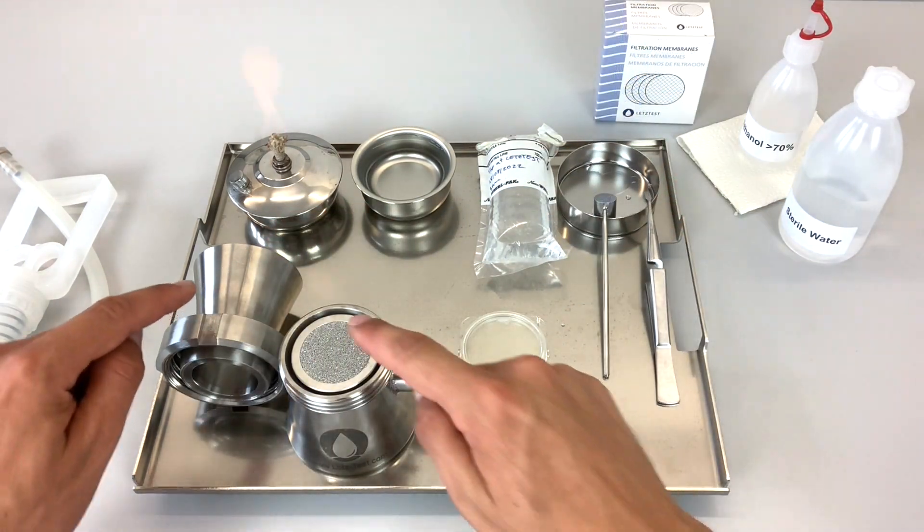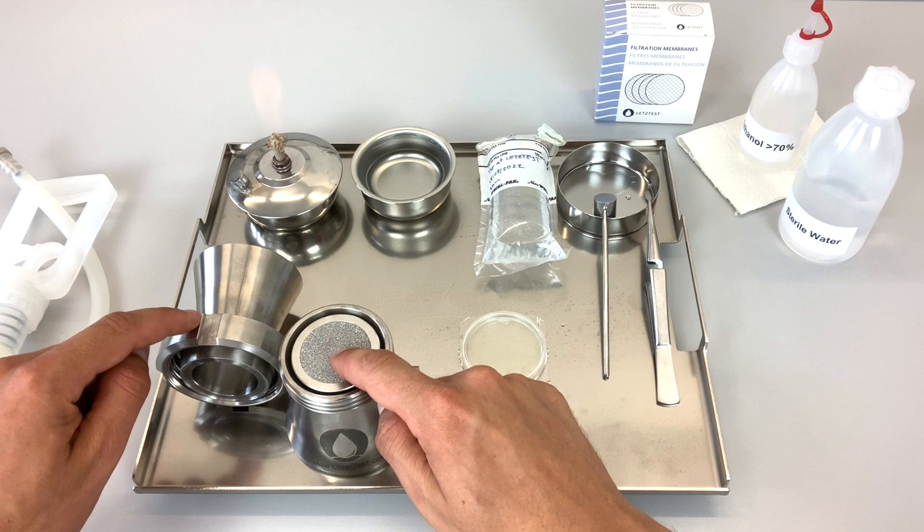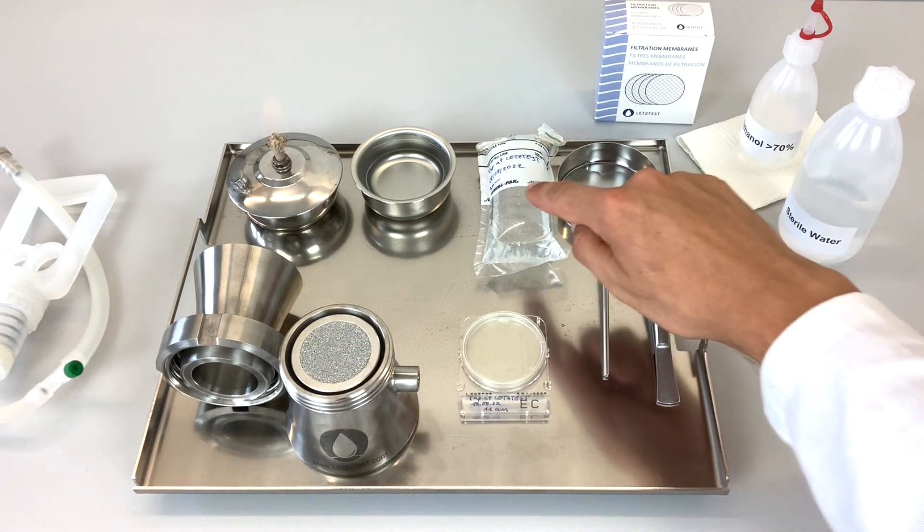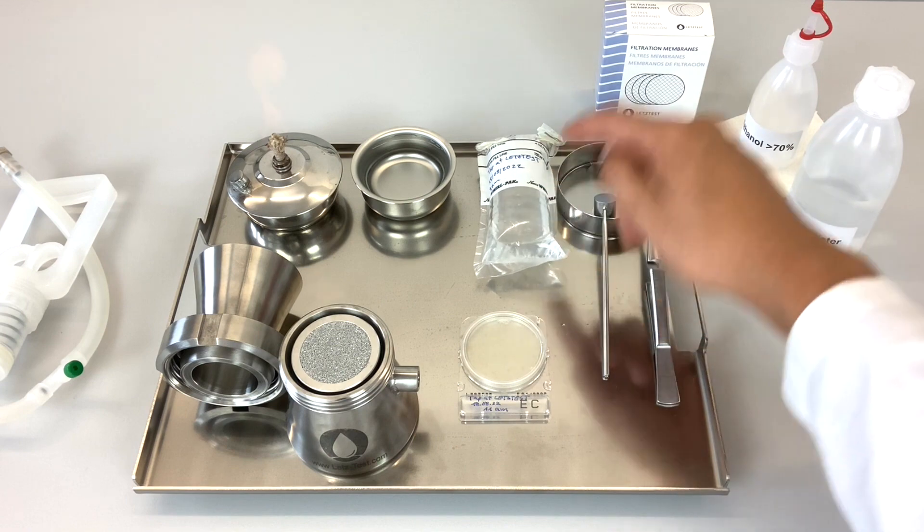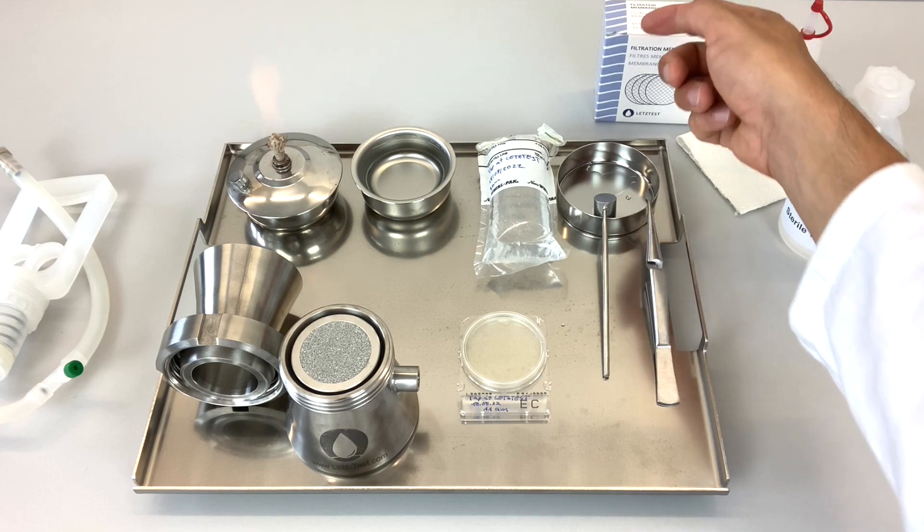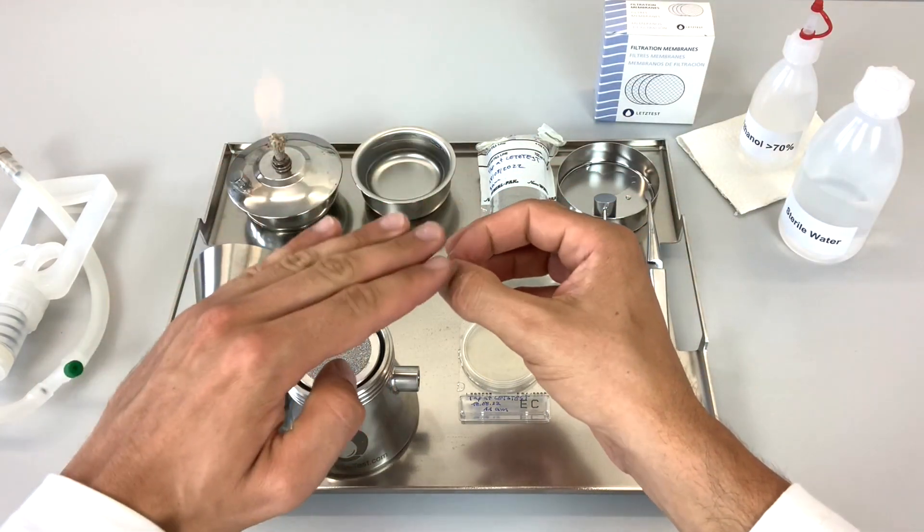The next step is to sterilize the two critical parts of the membrane filtration unit and then filter 100 milliliters of the first water sample through a paper membrane to collect all bacteria from the water sample on the surface of the membrane. The paper membrane is then transferred to the activated chromogenic media plate.